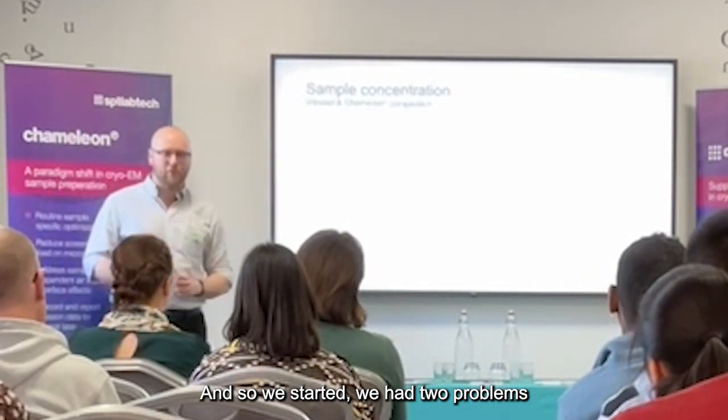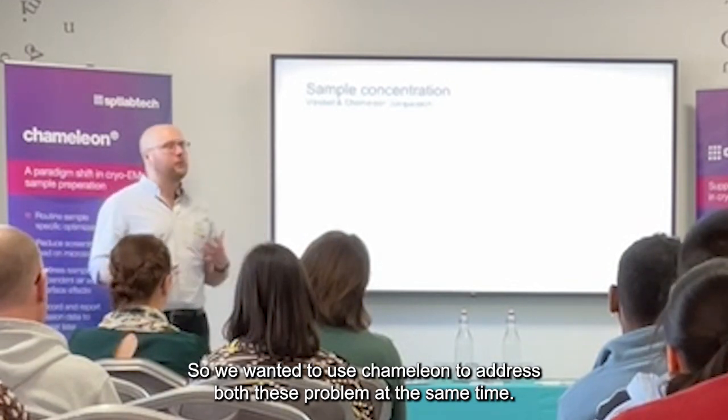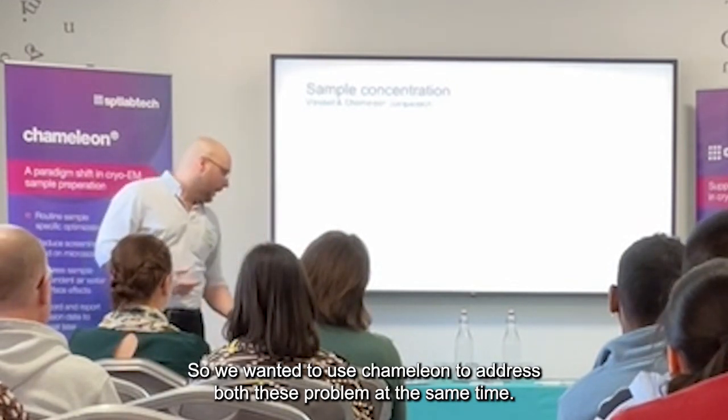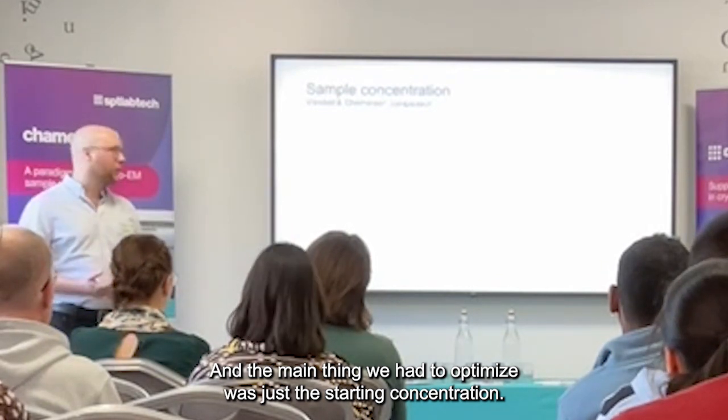So we had two problems: the preferred orientation and the partial denaturation. We wanted to use Chameleon to address both these problems at the same time. And the main thing we had to optimise was the sample concentration.